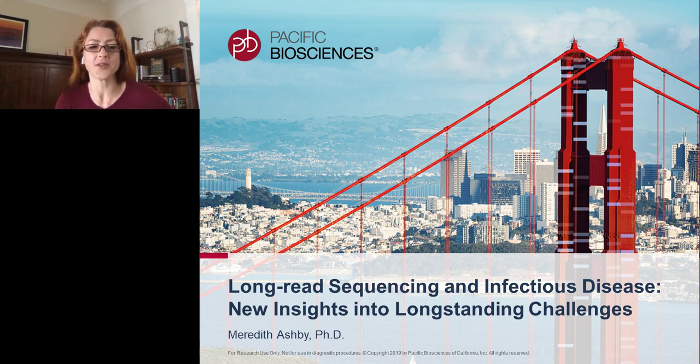I wanted to talk to you about long-read sequencing and infectious disease, and how advances in genome sequencing technology are allowing new insights into infectious disease genomes and are helping us begin to make more progress against long-standing challenges in this area.